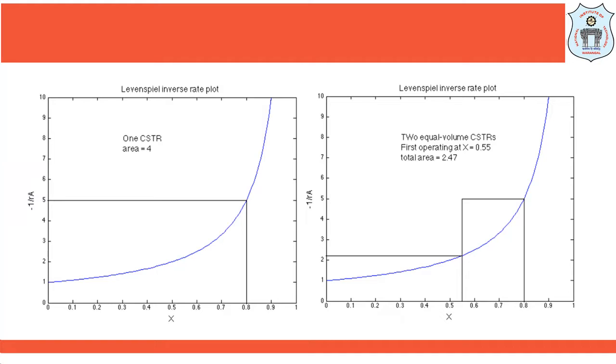Axial dispersion is a combination of all processes that spread molecules out along the axis of flow that would otherwise stay together in plug flow. That is diffusion, turbulent eddies, flow between catalyst particles, etc. So the fewer CSTRs in the model, the larger the dispersion that is simulated. So we should know that it is economically beneficial to operate several CSTRs in series or in parallel. This allows, for example, the first CSTR to operate at a higher reagent concentration and therefore a higher reaction rate.